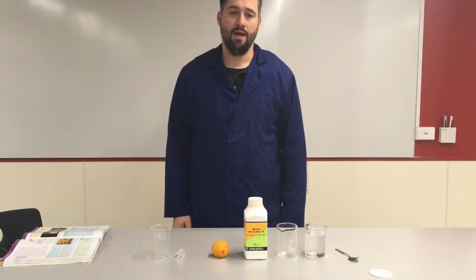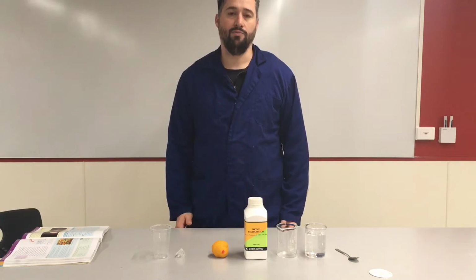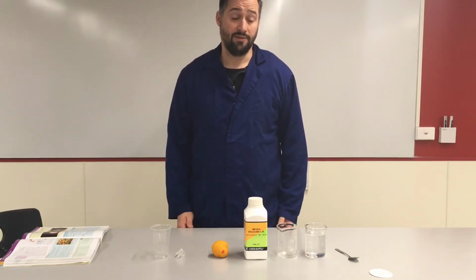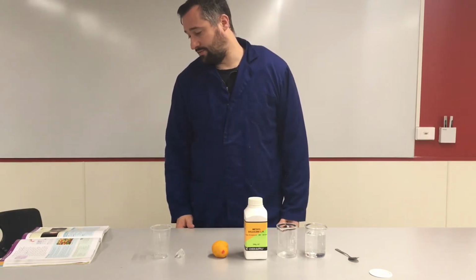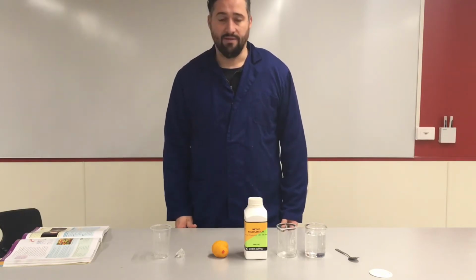Hi, you're right. Today we're going to be conducting a demonstration on a prac in your book called Practical 6.2, called Physical Change. The aim of this prac is to conduct a series of activities and experiments in order to explore physical change and to be able to identify the evidence of change.